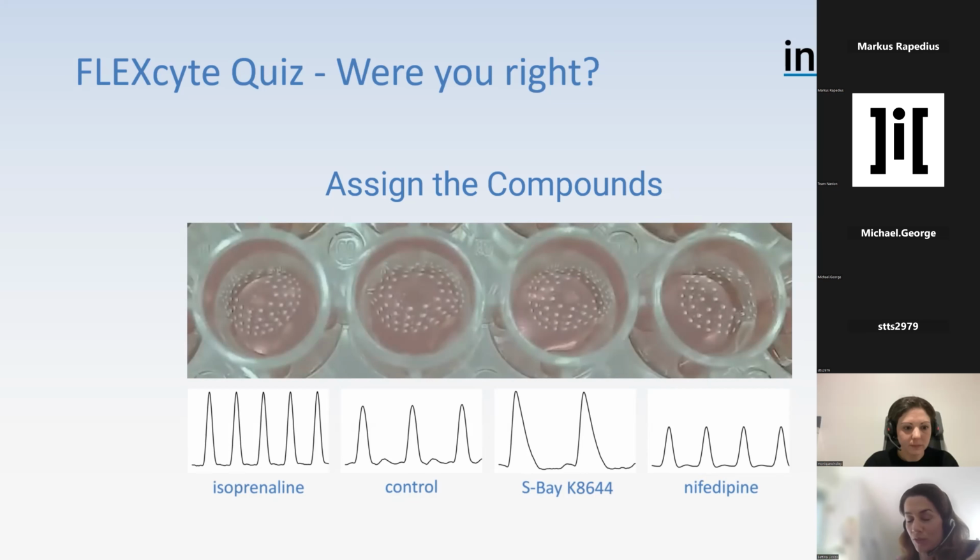If you have an effect on electrophysiology, that's fine. If you would have an effect on calcium, you wouldn't see that if you only do patch clamp. Of course you would see that too. But it's the best way basically to start from the back, because then you can include all the others as well. That's why I think this is the most important way, to start basically from the last bit of the contraction cycle. Or one does both. Yeah, that's also an option.